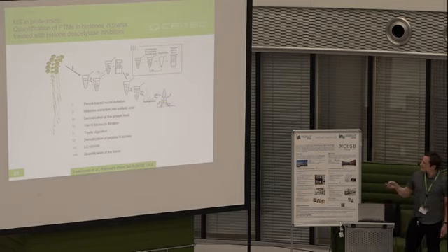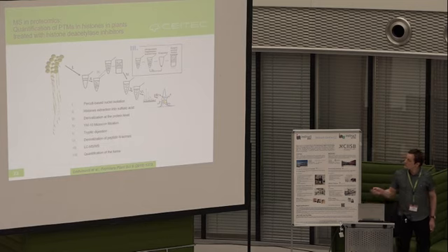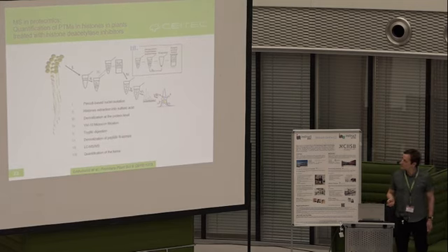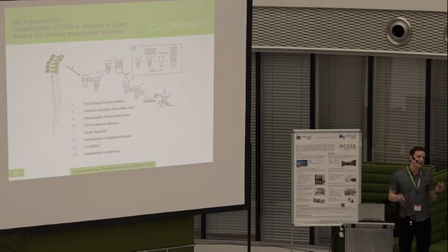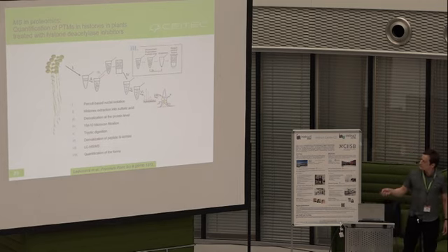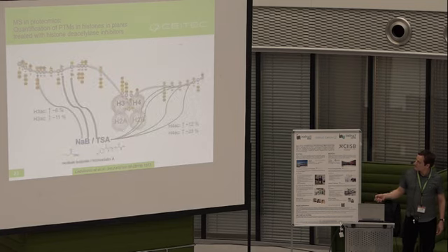So you can see that our colleagues wanted to study post-translational modifications in histones. Again, it is not a straightforward task that you would put a vial in the mass spec and run an automatic analysis. You can see that there are 7 steps of extraction, derivatization. Each of them had to be optimized to obtain the final result.